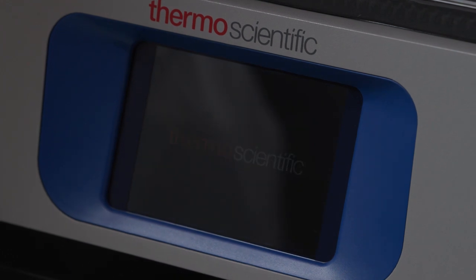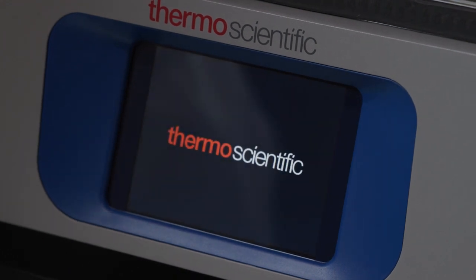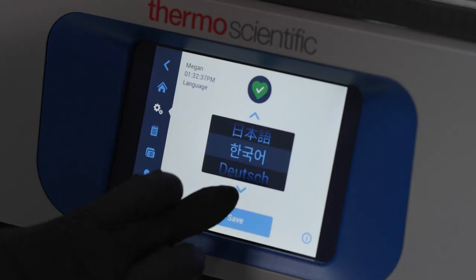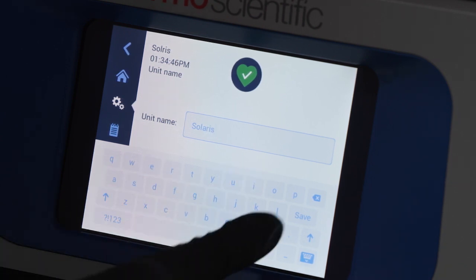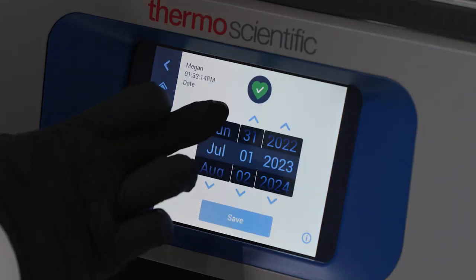The first time you turn on your new Solaris temperature-controlled benchtop shaker, you'll progress through a startup process. During this process, you can select your language from ten different options, enter a name for your shaker, and set your city, country, date, and time.